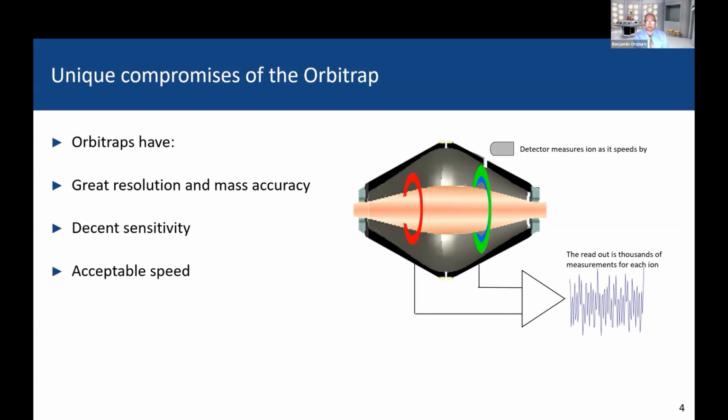and we get acceptable speed, and there's an inverse relationship there. And as we've heard from everyone doing SCoPE-MS, we're using 300 milliseconds at 500 milliseconds fill time to offset the fact that the sensitivity really isn't all that great, right, for this instrument.